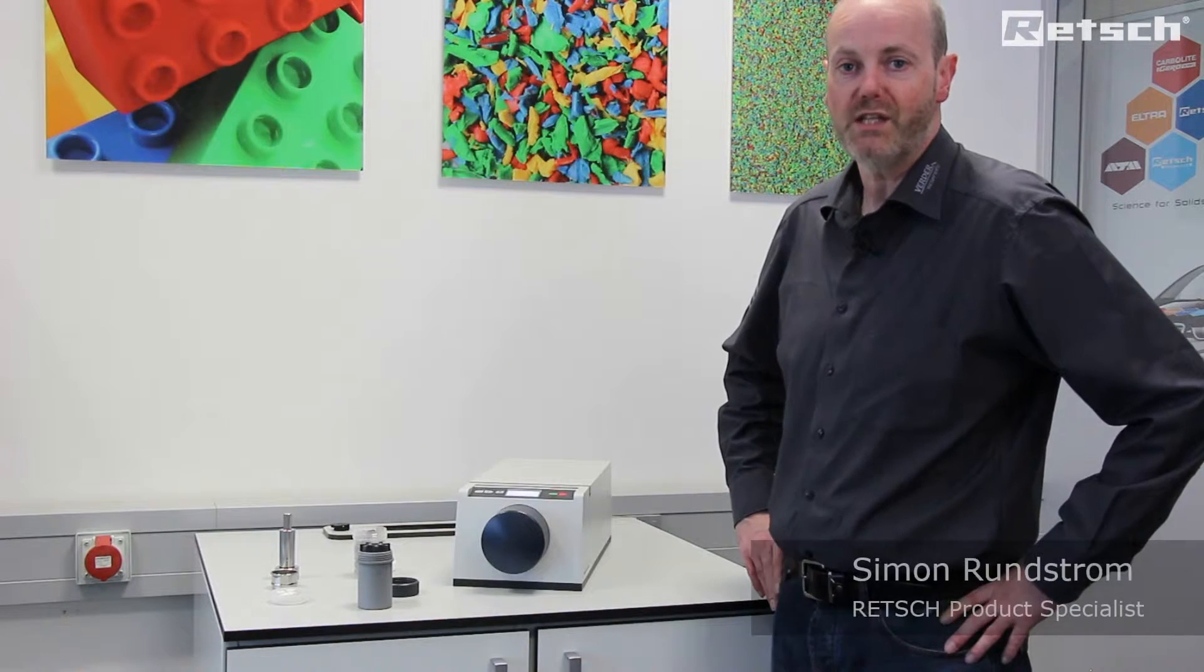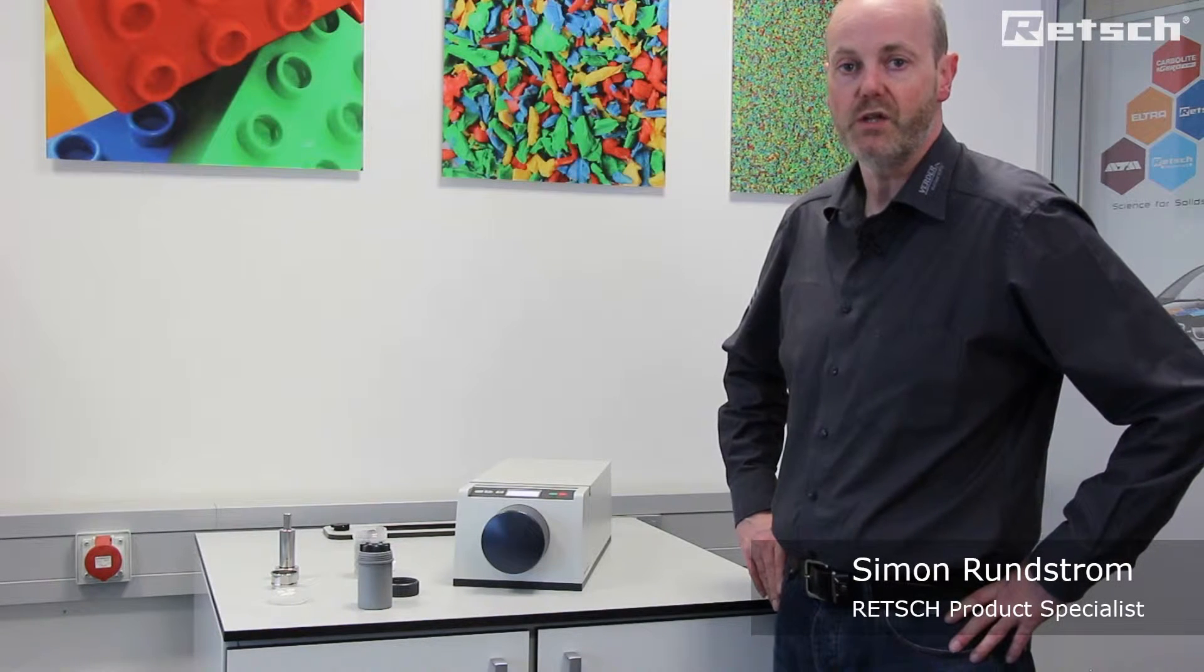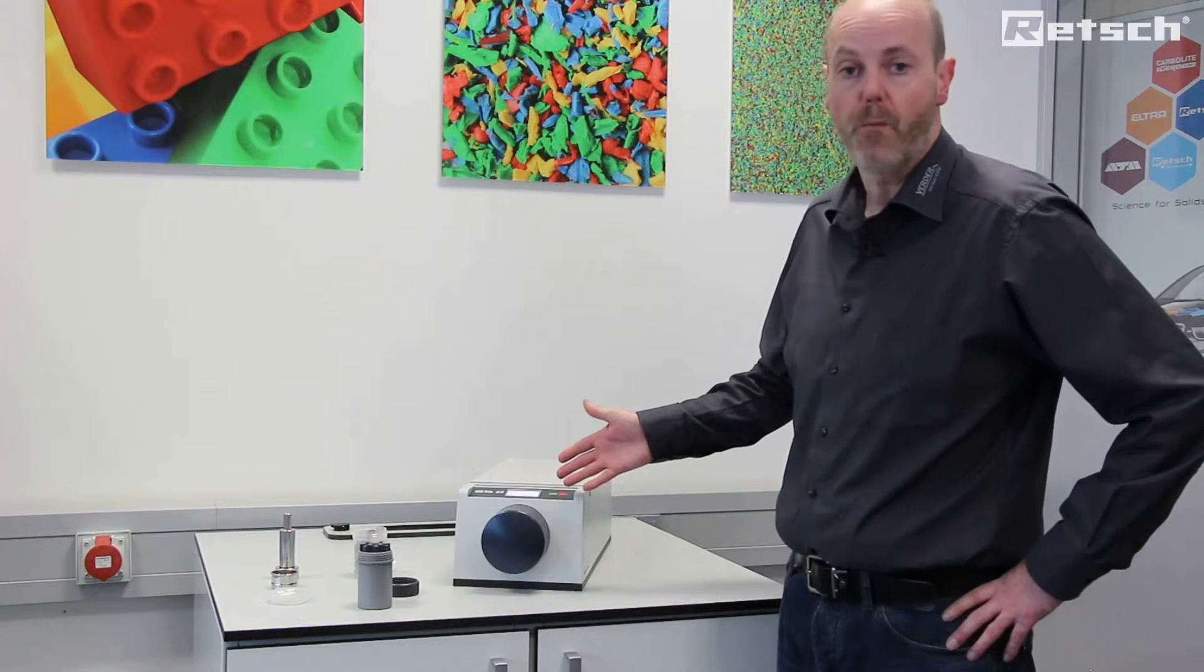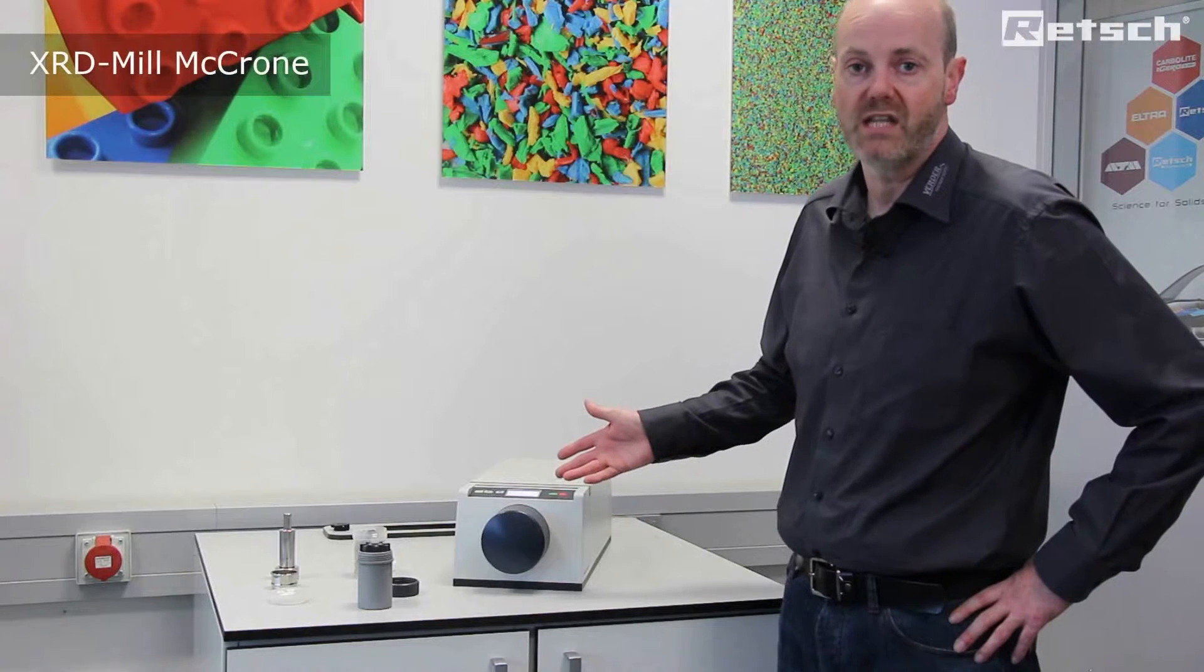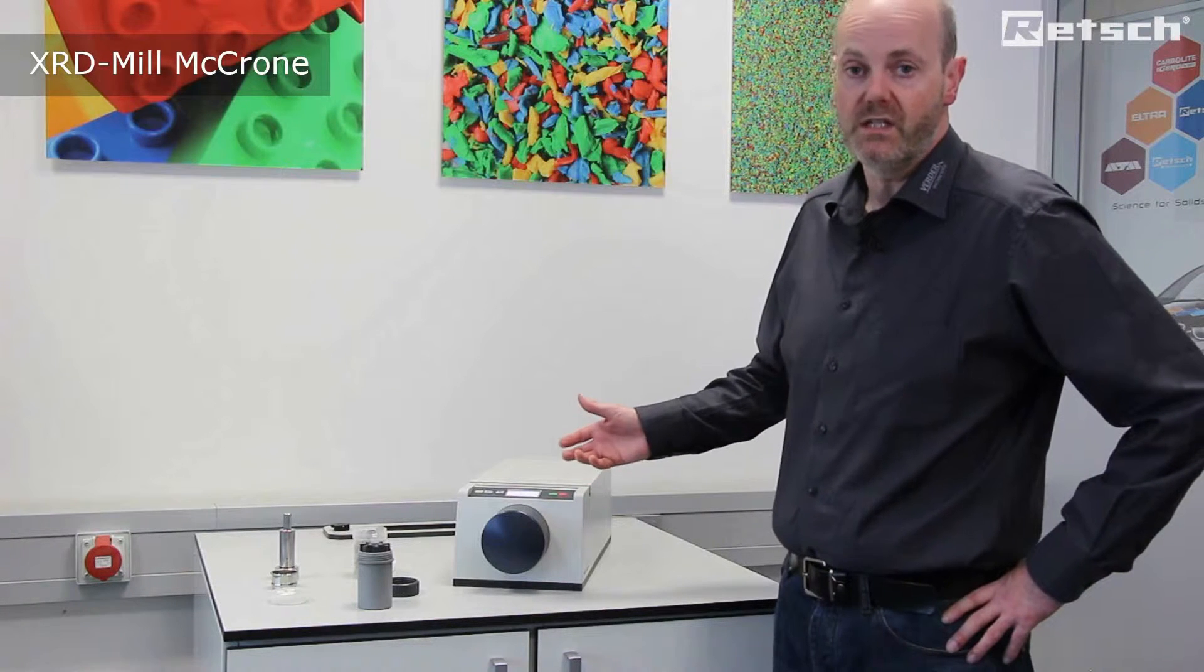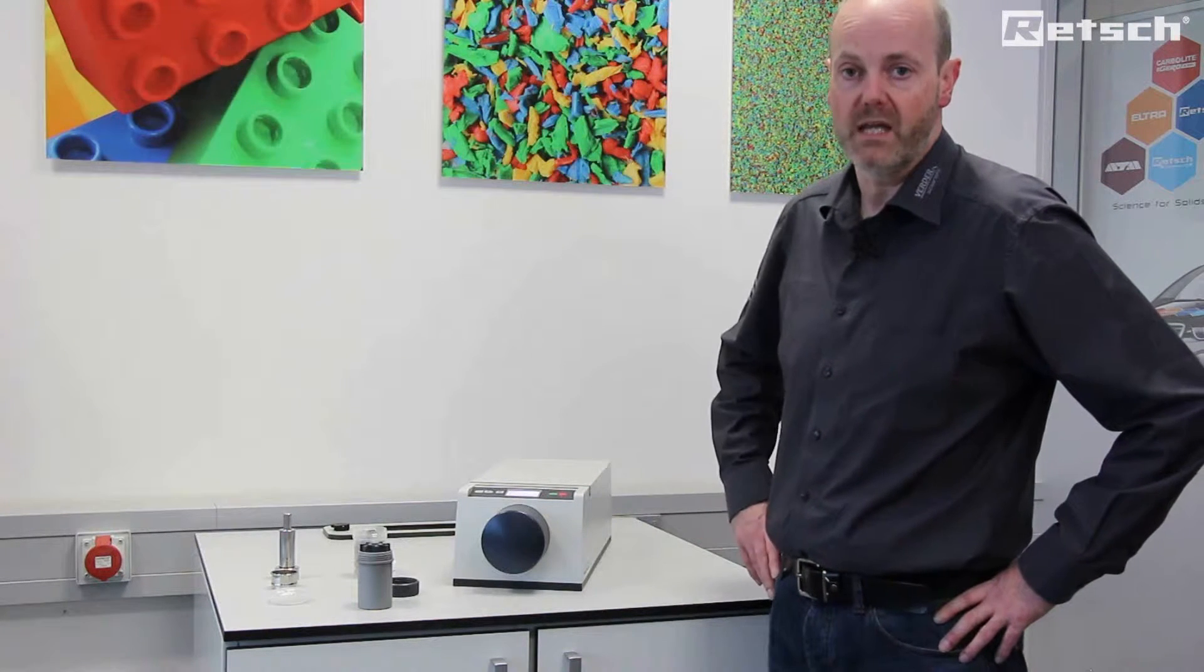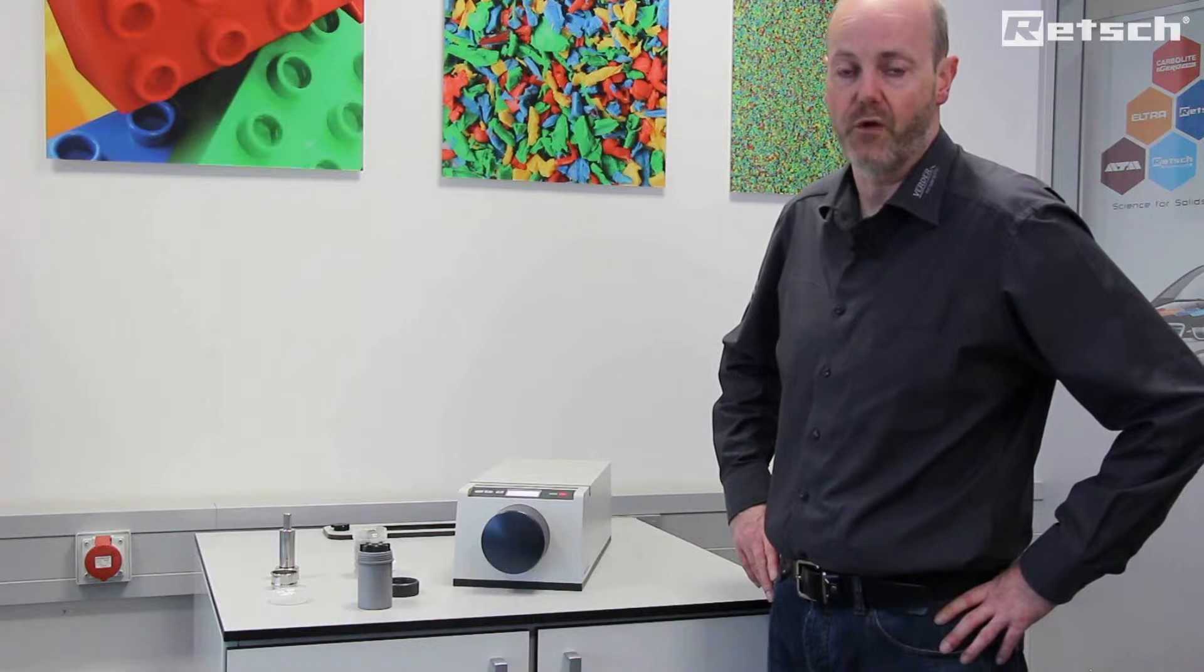Hello, I'd like to take this opportunity to introduce the small compact benchtop XRD mill McCrone. This instrument falls within the family of ball mills available from Retsch.